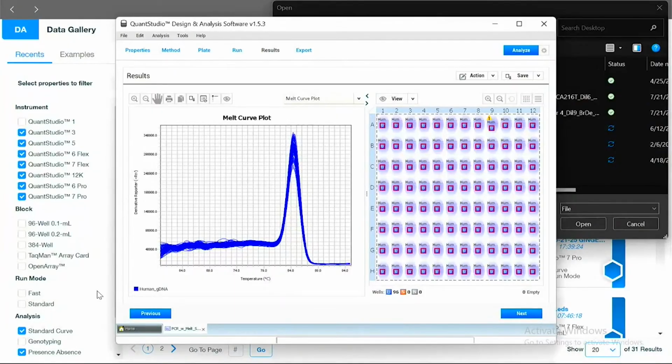Yeah, so you actually have to write across the well. The way that instrument is set up is we focus the cameras and isolate just the wells, so we only capture the fluorescence inside of that defined well area. As long as you're writing outside of that, you're fine, just not inside.